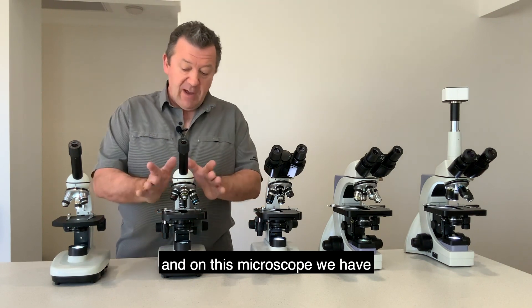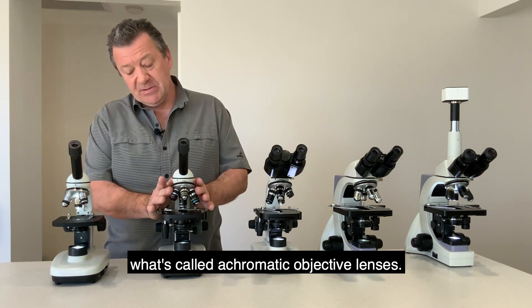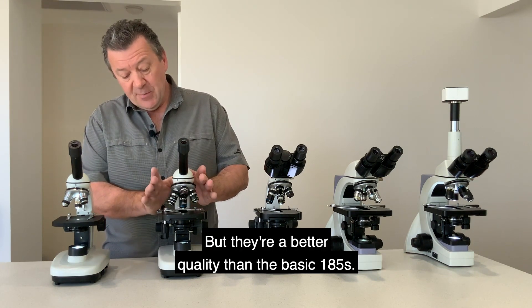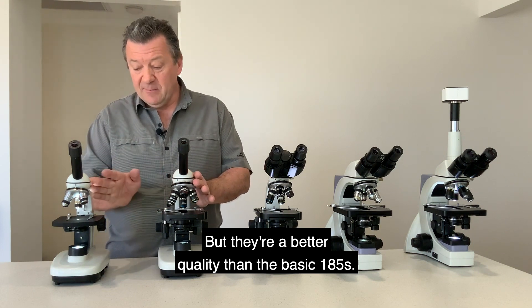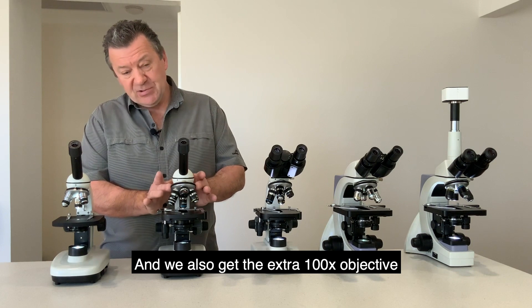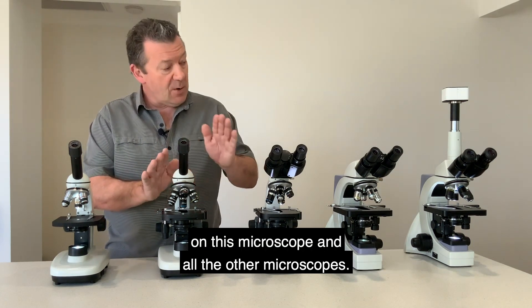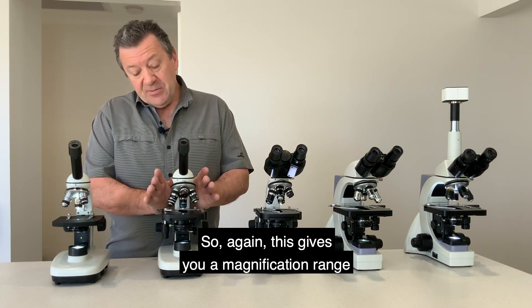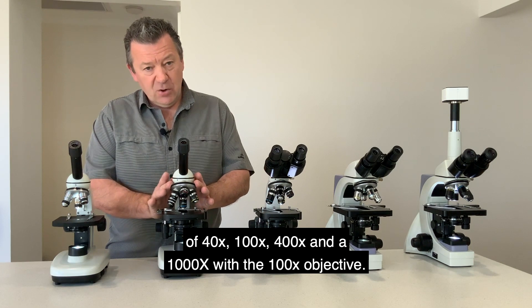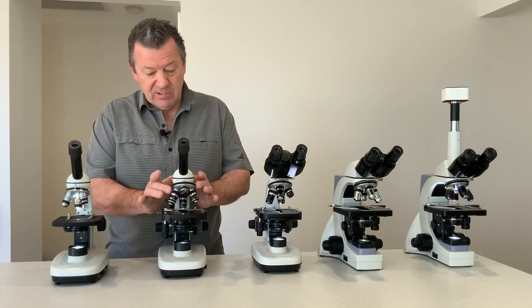On this microscope we have achromatic objective lenses. These are all-glass objectives but better quality than the basic 185s. We also get the extra 100x objective on this and all other microscopes, giving a magnification range of 40, 100, 400, and 1000 times.